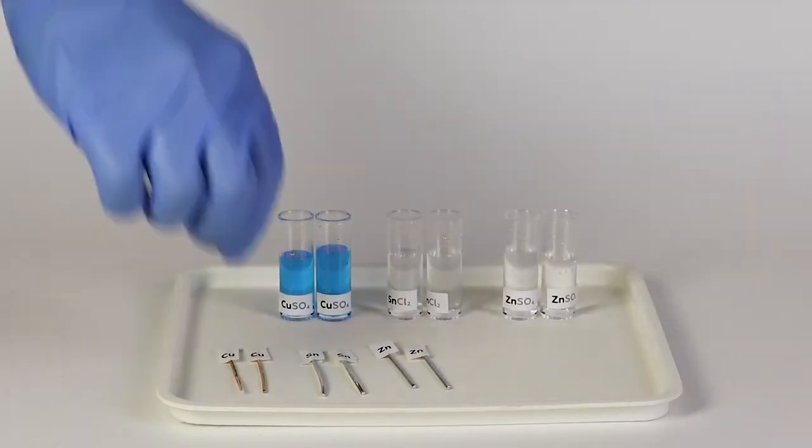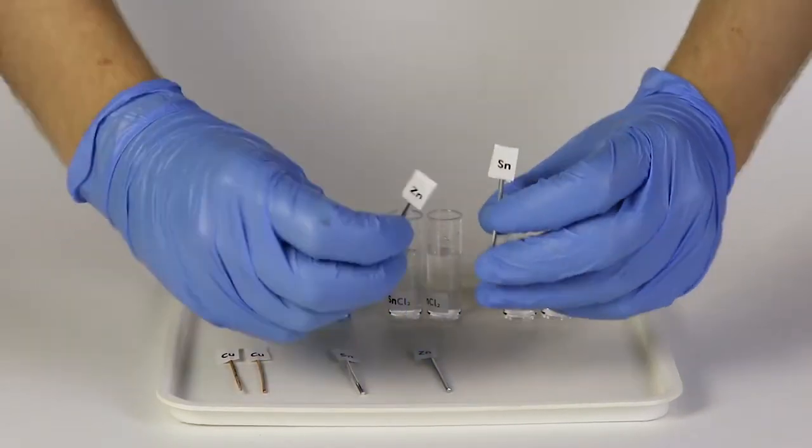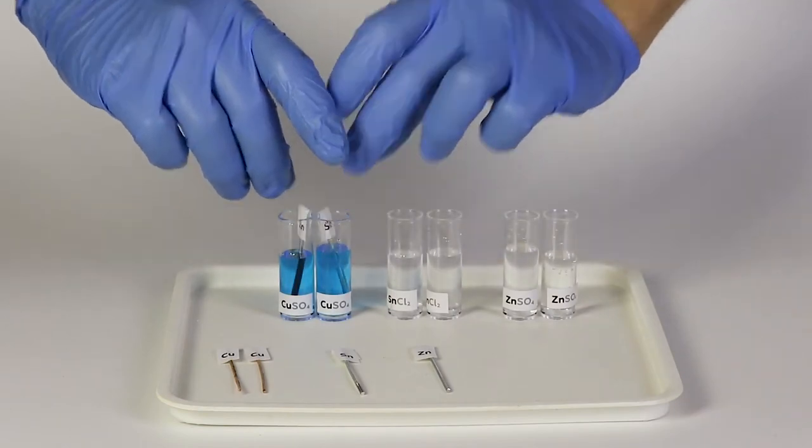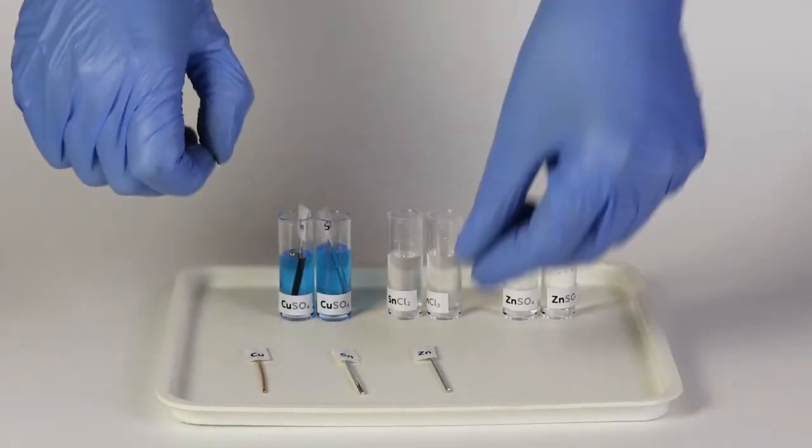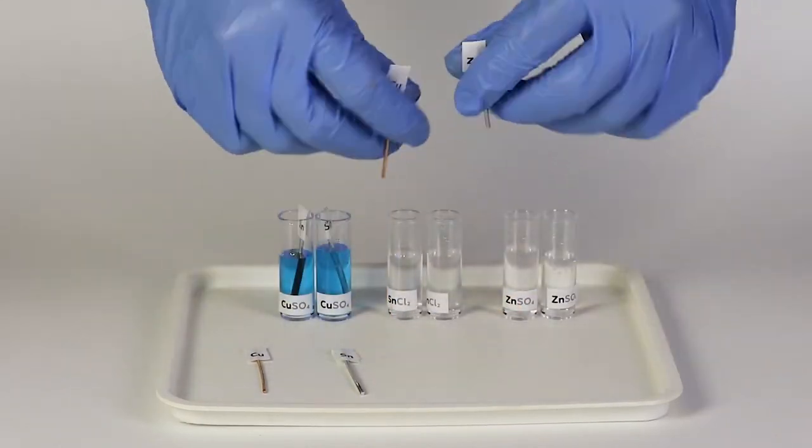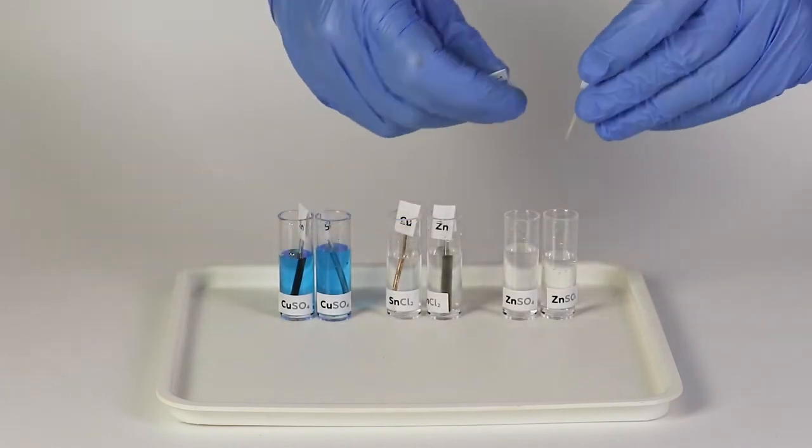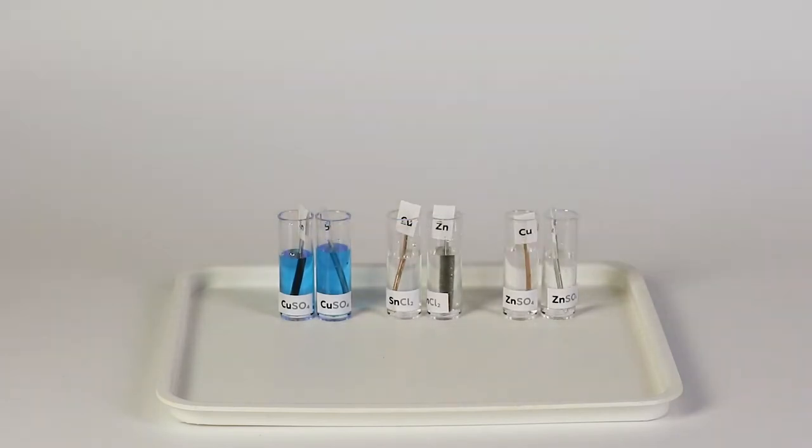Put a piece of zinc and tin into the solution of copper sulfate. Put a piece of copper and zinc into the solution of tin chloride. And finally, put a piece of copper and tin into the solution of zinc sulfate.